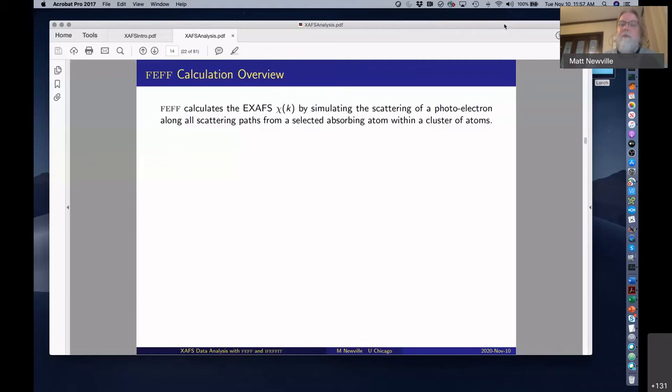The data processing will pick E0 based on the first derivative, and that is subject to noise and variation. So you may want to make sure that those are all the same for a set of data that you believe are approximately the same structure. That way, the backgrounds will be more uniform, more consistent, and the analysis would be more consistent.